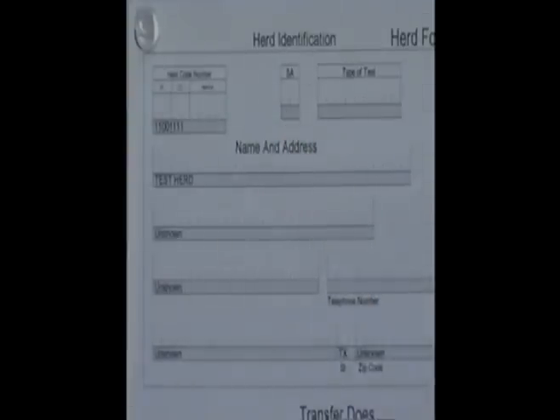That number comes back pre-printed from here on out as a 74, which we are under the Texas umbrella, which is number 74. The type of test should come back pre-printed DHIR 20 if you were on standard test. There are several test plans that a person could be on. Every other month, which is DHIR 27, or DHIR APCS 22. APCS is AM/PM component sampling.